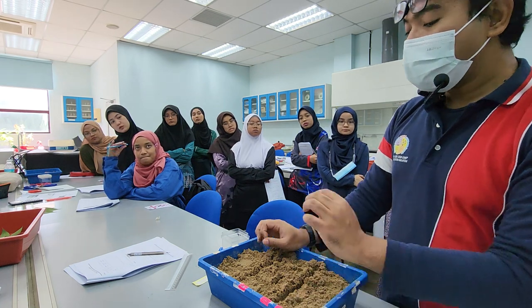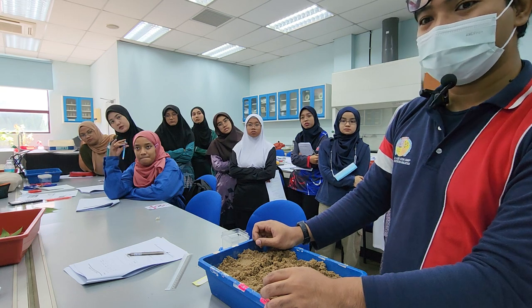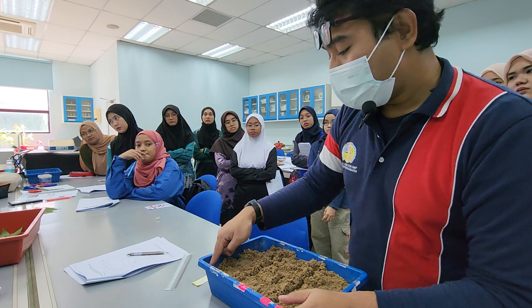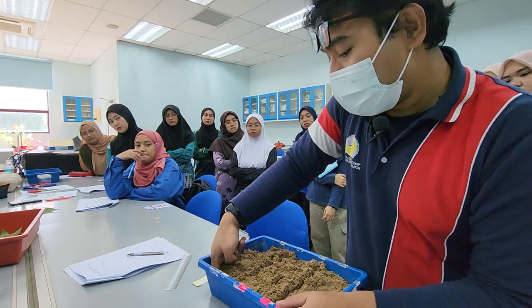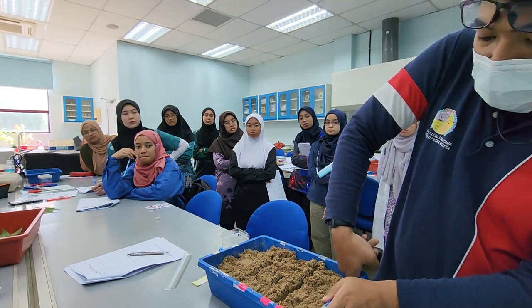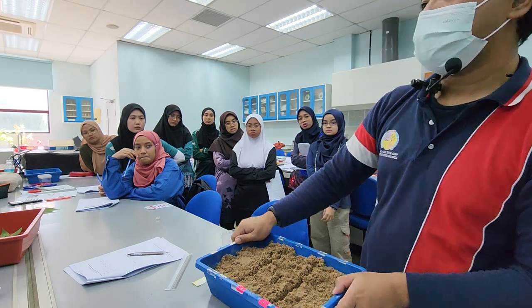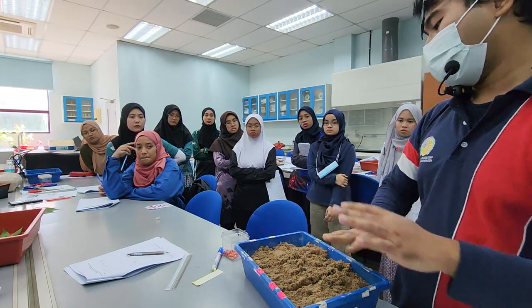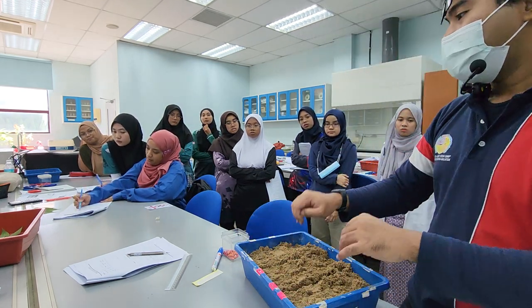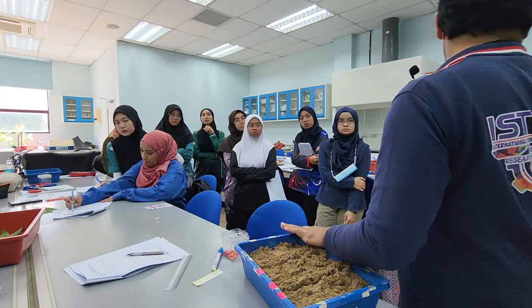Okay, how do you water this? Spray. Do you have the spray? No. It might be a good idea to create a hole at the corner here. One here, one here, or maybe one here. Put the water in and then start to swirl this thing around, so the water will fill in homogeneously throughout the media. Then once you're done, you're going to get this plastic film.